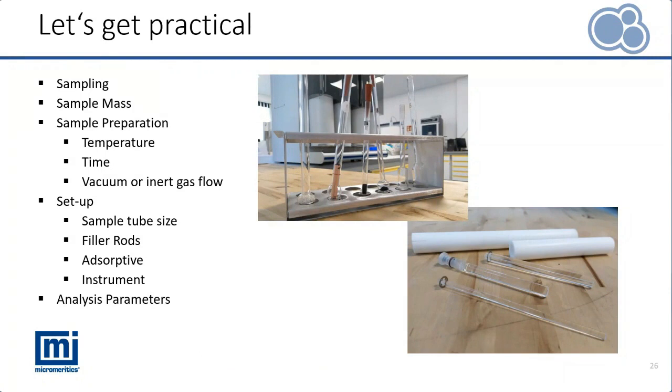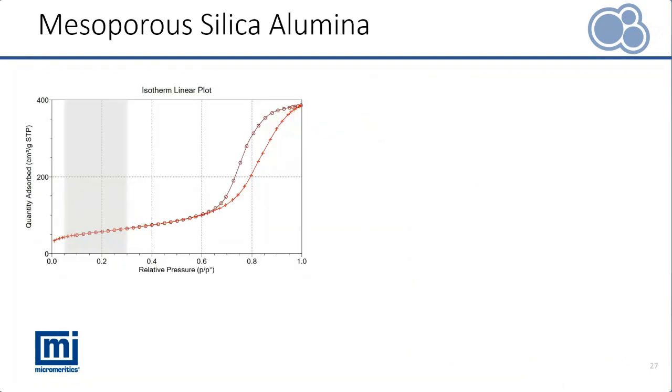I would like to use real examples now to give you a guide about how to use these parameters in order to optimize your adsorption measurements. Let's get started with the mesoporous silica alumina. This is one of our reference materials.